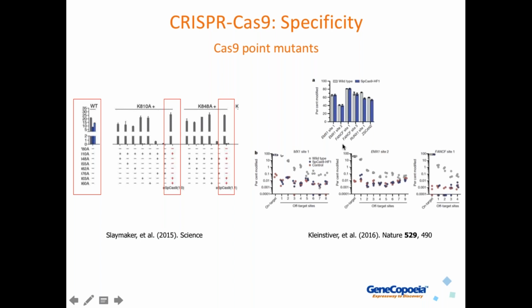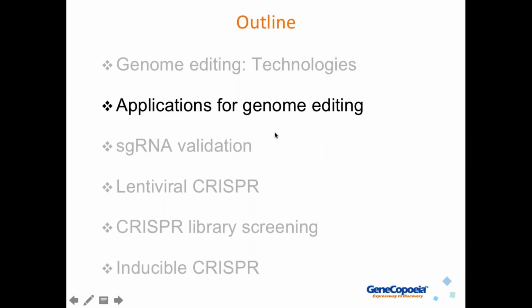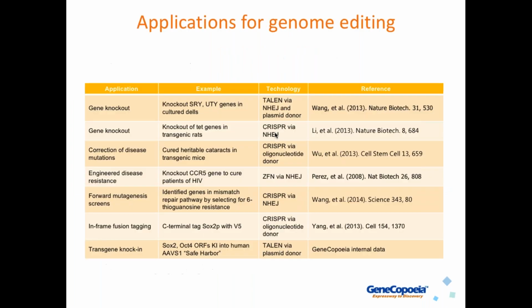So this was actually the most promising development so far for high-fidelity CRISPR-mediated genome editing, because unlike the nickase, you can use one single guide RNA, so there are no longer any orientation or spacing constraints, and you can get quite high levels of high-fidelity genome editing.